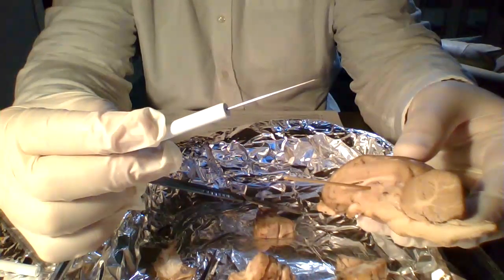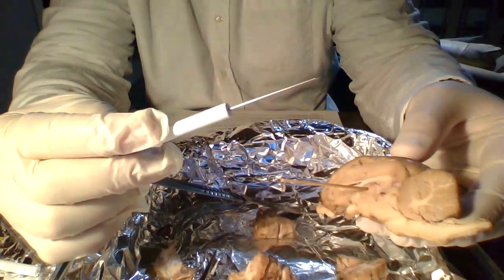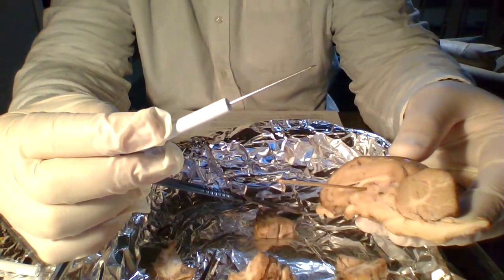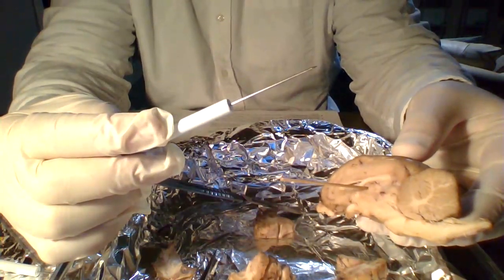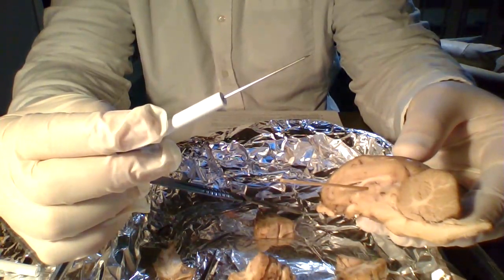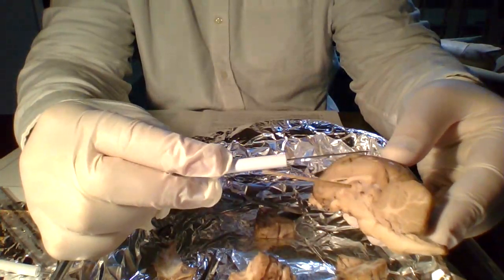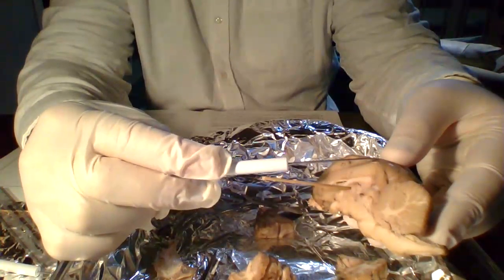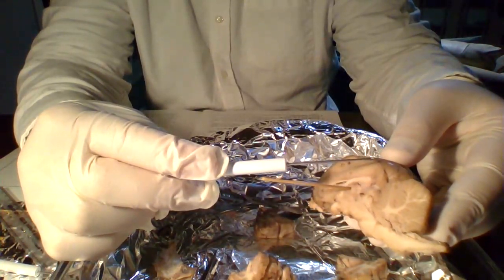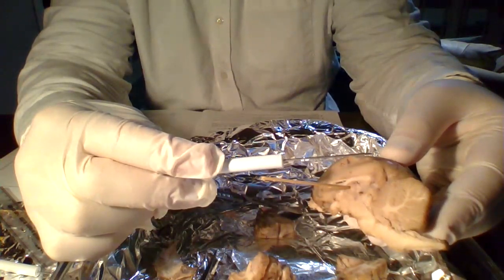Unfortunately, I believe I cut up the Broca and Wernicke areas, but they are on the lobes. Occipital lobe of the cerebrum: the rear region of the cerebrum responsible for interpreting visual impulses.